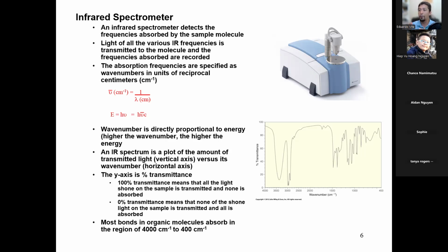And so when you absorb the energy, where does the energy go? It begins to vibrate the molecule. That energy is being absorbed by the spring. For example, look at this graph. There's a really big peak at around 3,300, 3,400 on the x-axis, right? That's a vibration that is happening at that frequency.